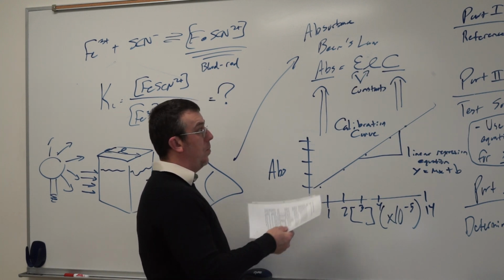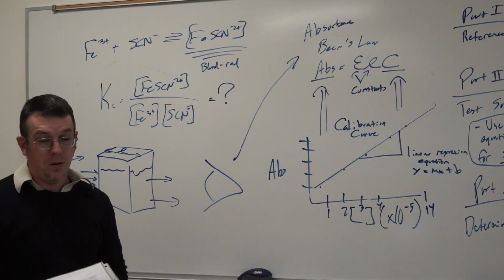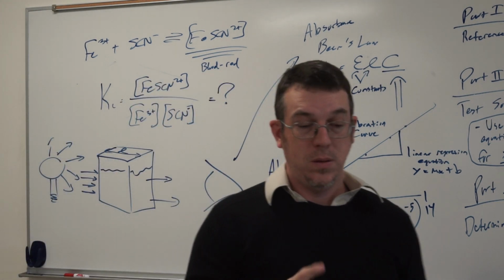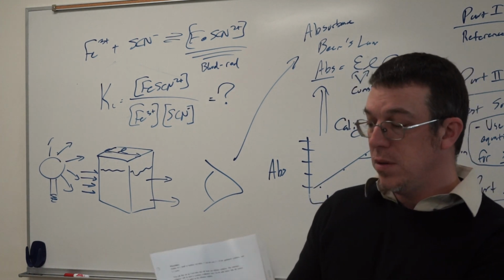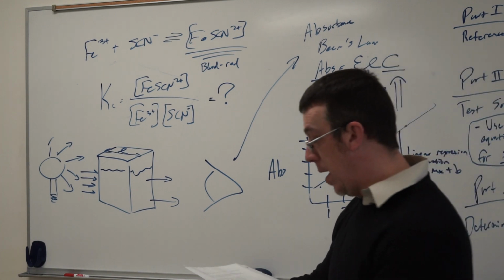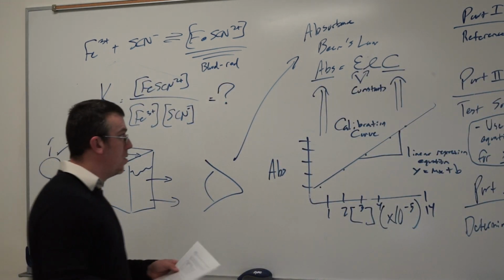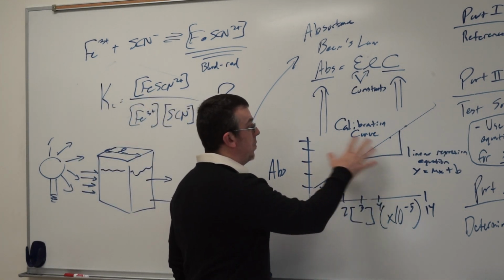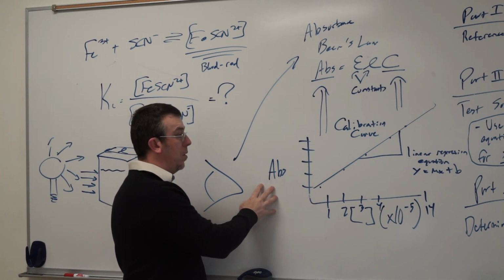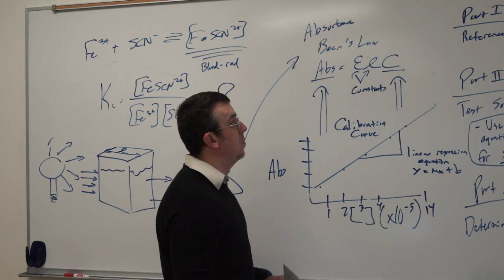What we'll do is we'll set up what is called a calibration curve. And in the calibration curve, you're going to be looking at two different solutions. You'll be looking at the reference solution, and then you'll also be looking at the test solution. Again, these are found in the lab manual. So you'll have 5 different reference solutions, and those are what you're actually going to make a plot of. So you're going to form what is called a calibration curve, and you're going to plot absorbance versus the concentration of just the reference solutions themselves.